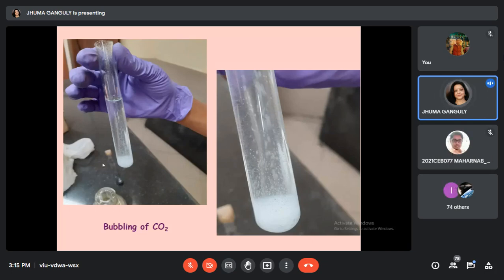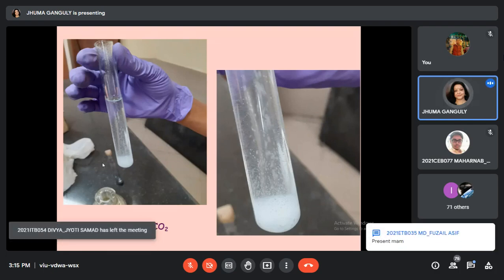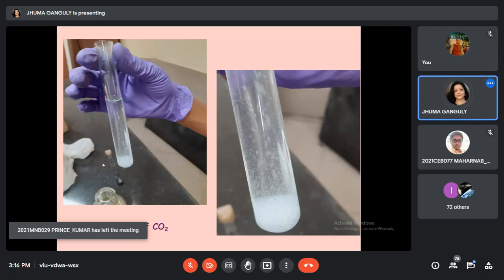So this is the carbon dioxide evolved. We observed that much effervescence in the laboratory also. Depending on the acidity strength, you may see vigorous carbon dioxide evolution or slow effervescence, and you can differentiate and observe from this whether the acidic strength is higher or lower.